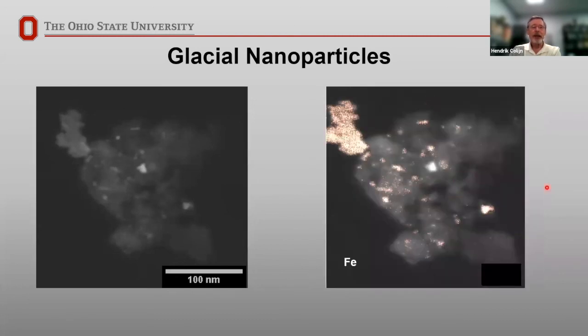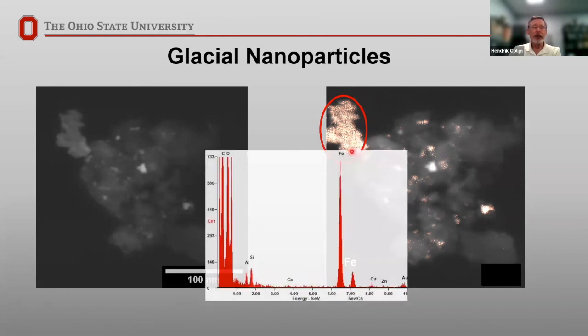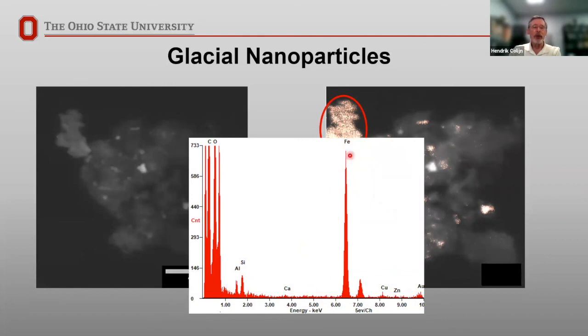It turns out that it's very rich in iron. So that's an iron oxide, because this also showed very strong oxygen. And you see that many of these bright spots in the silica matrix are made of iron. So it has a lot of iron dust in this, iron nanoparticles. But not all the particles light up. Having a spectrum image, I can select these pixels in my image and come up with a very nice spectrum showing this high iron signal coming out from that area.